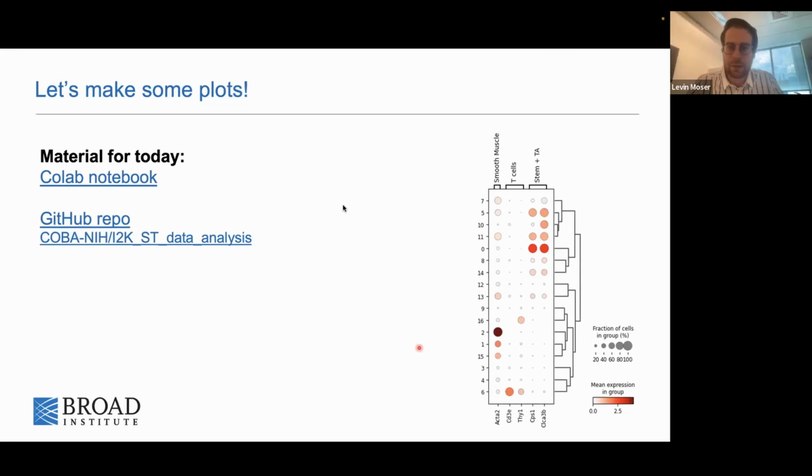Did you receive the link? So this is a Google Colab notebook. I prepared everything such that in theory you should be able to run it step by step. But of course, I'm going to give you instructions on how to do that. Is that link working for you?